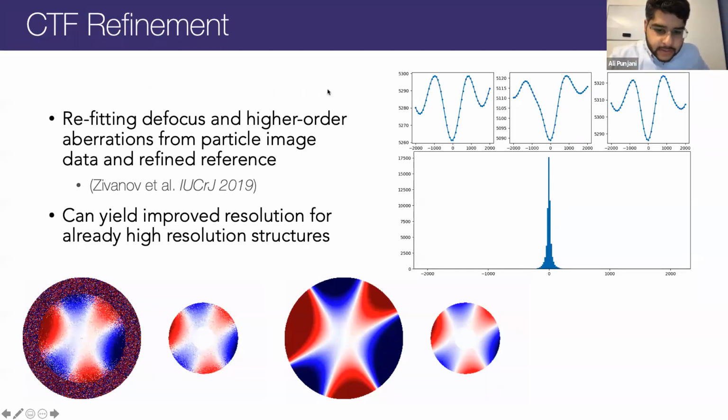Okay, the next topic we're going to start talking about is some more advanced techniques for doing high resolution refinement. Specifically, we're going to be talking about CTF refinement of two kinds. These methods for CTF refinement have been developed relatively recently by a number of groups.